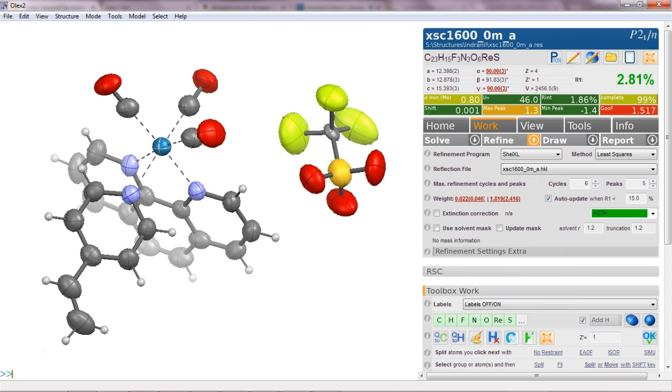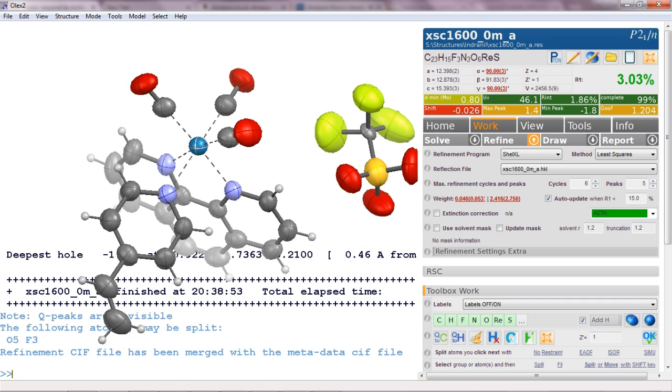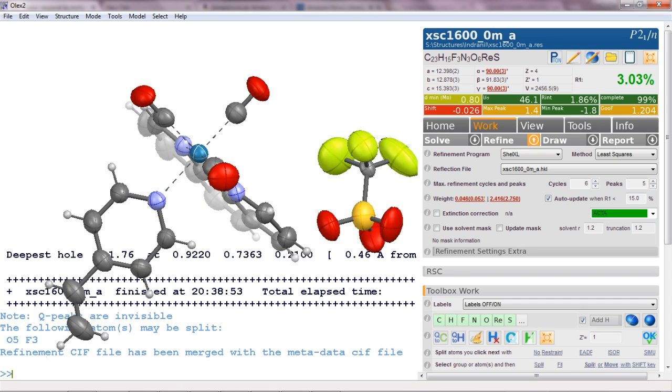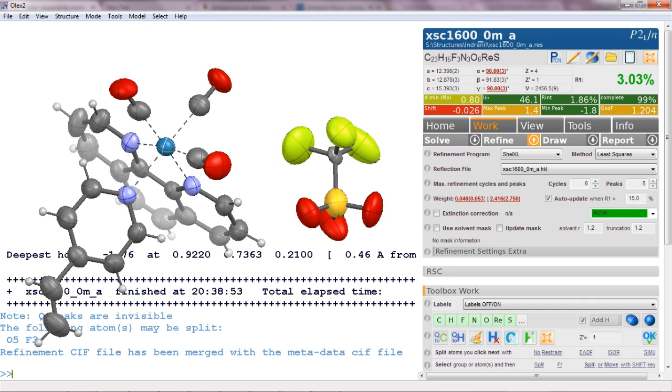Okay right let's refine it using SHELXL and I hit refine and we should see what we get. And we get an R-factor of just three percent. Something is moving and clearly what is visible here if I just move this over here, that the sulfur here is bigger than it ought to be. This carbon is smaller. Those fluorines are bigger and those oxygens are smaller.